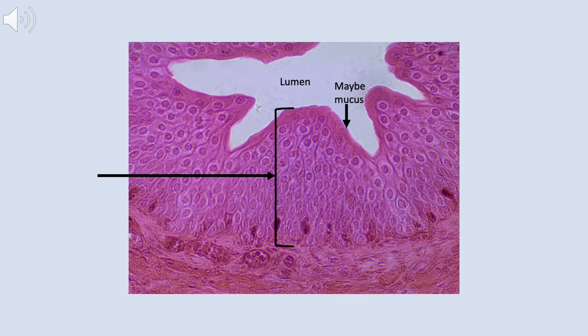Now that I've figured out that the primary tissue type is an epithelium, likely a mucous epithelium, that means there's only a couple of options that it could be. That lumen being kind of star-shaped the way that it is indicates that this is probably in the urinary tract or urogenital tract in a female or male. And so knowing that, and knowing that it's an epithelium, we need to take a look at the top layer of cells and figure out what's going on.